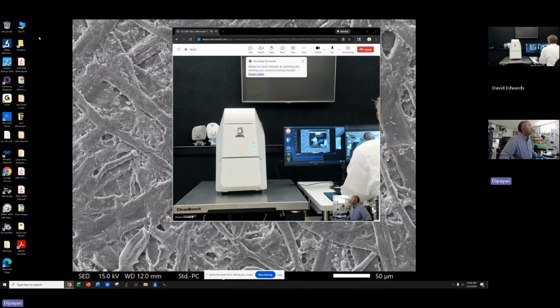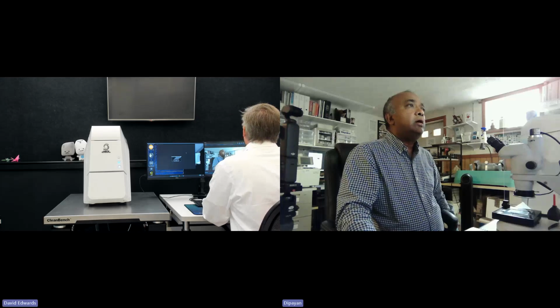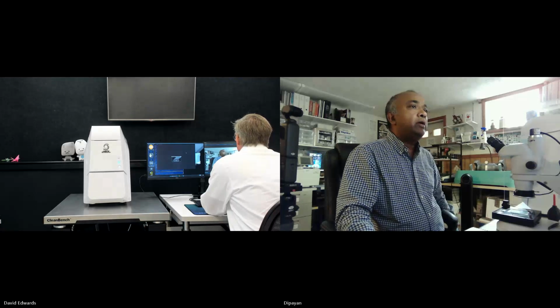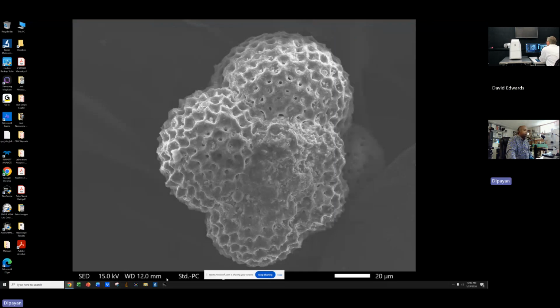Last time my whole screen got a red line, like a red margin, red boundary. It's not coming now. All right, so click share screen. Make sure you're sharing the screen and not the application. Yeah, the entire screen. So you should be able to see my whole screen now. Yes, I can see your whole screen. Oh, awesome. And it's recording already? I didn't stop, did I? No, I didn't stop. It's still recording.